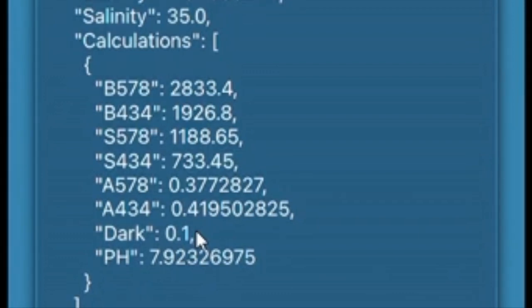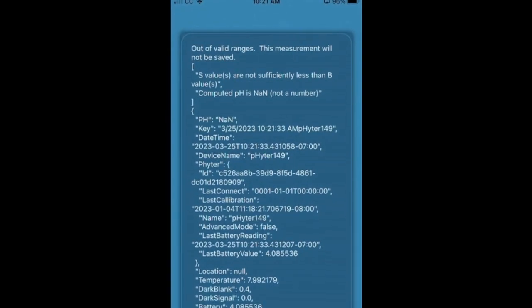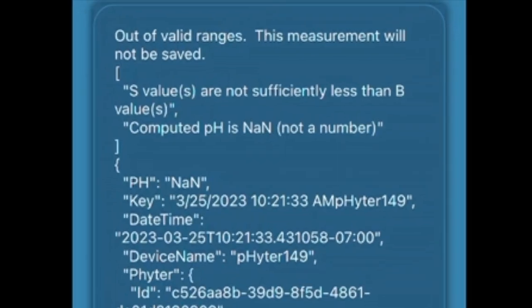In sunlight, you need to keep your finger on top of the stopper hole. And then the pH will be in a range, typically for seawater, between about 7.5 and 8.1. And sometimes you'll get a failed reading because there's something out of range.